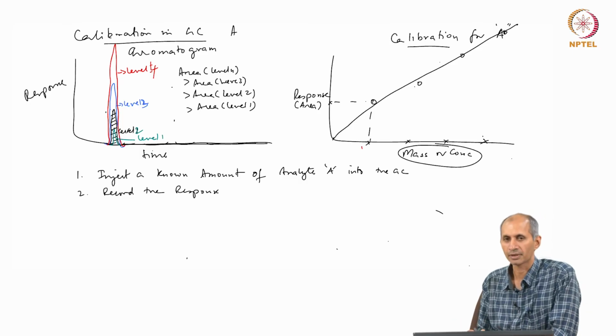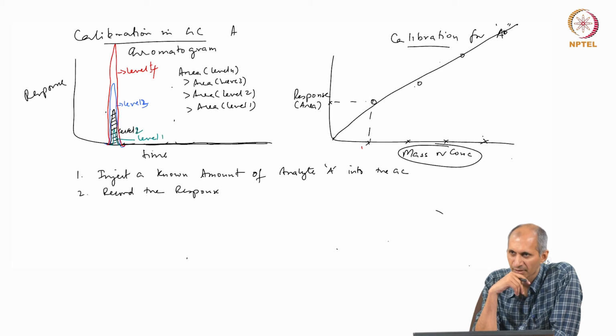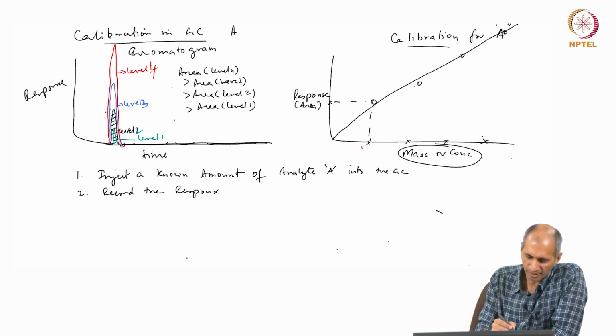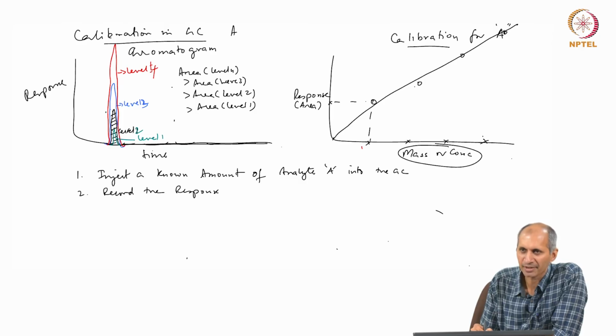So, this is a calibration, which means I need to know what is coming. So, one of the features of the calibration is the information I am getting here, one of the things information I get from a chromatogram. This is on a time axis, right.